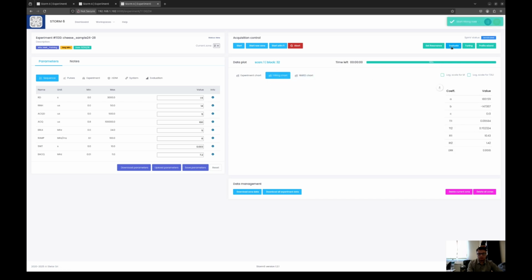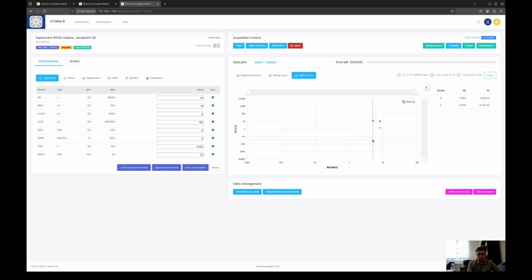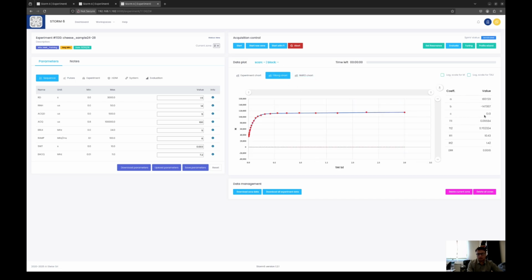So I have to press evaluate. So these are the previous values, and then this will be updated with new values. Okay, so the evaluation is done, and you see now we have two values, and this value is almost negligible. You see the value is really small, and these are again the contribution. So the second, because 5 mega is still at higher field, one component has more weightage as compared to the other component.